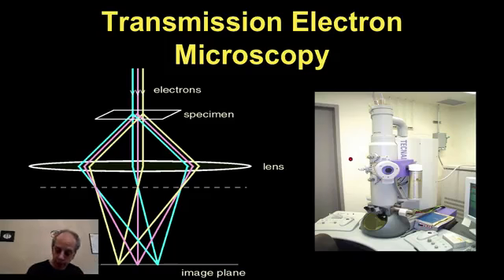This is a picture of this device. The high-end devices are not very cheap. They can cost millions of dollars. So this is not something that you carry with you like a regular digital camera. Once again, the issue is electrons are hitting the specimen, and then they go through and we capture them. So for us, it's a different way of creating images, but the important thing is that we can create images of these particles that are very, very small.